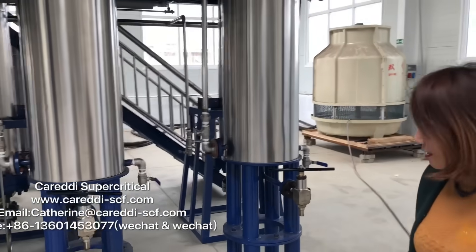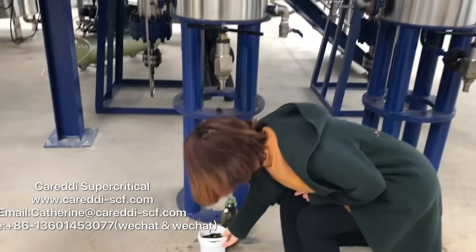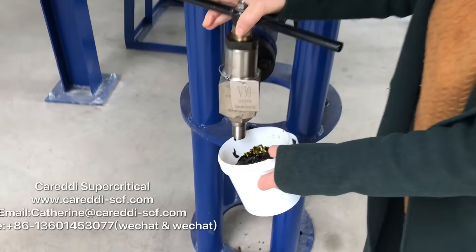From separator 1, we can open the valve to collect the oil. Now we got the mint oil.